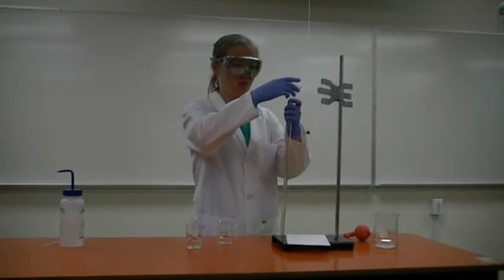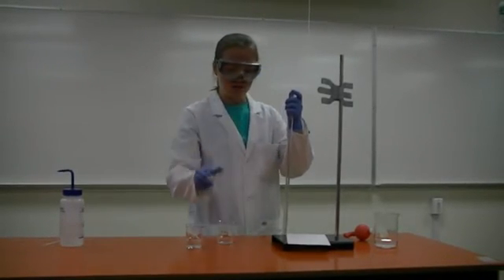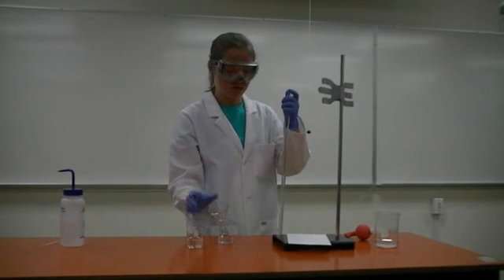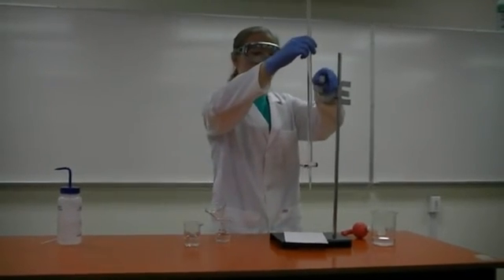As your filling solution may be corrosive, you want to ensure none of it can spill in your eyes. So keep it below or at eye level.